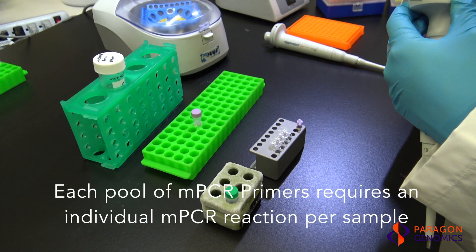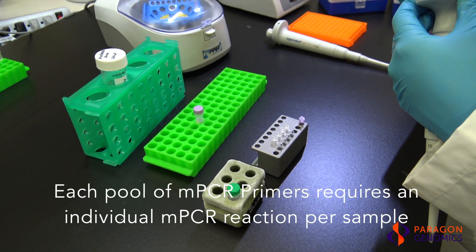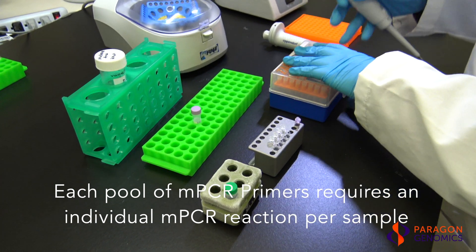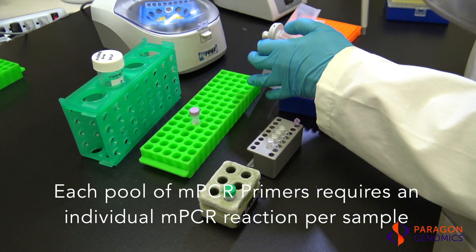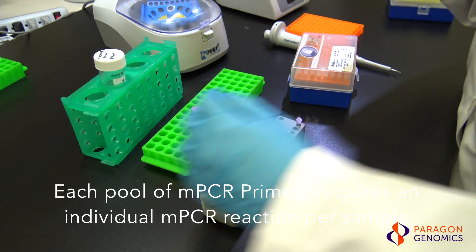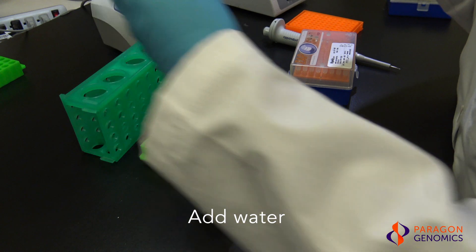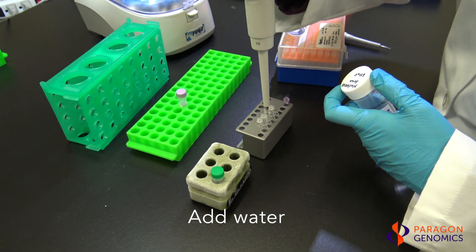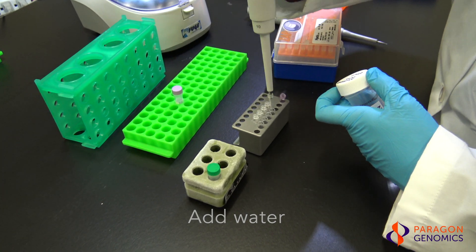Each pool of multiplex PCR primers requires an individual multiplex PCR reaction per sample. For a single pool panel, such as the CleanPlex OncoZoom panel, one multiplex PCR reaction is required for each sample. To assemble the reaction mixture for a single pool panel, first add an appropriate amount of nuclease-free water to each new PCR tube.